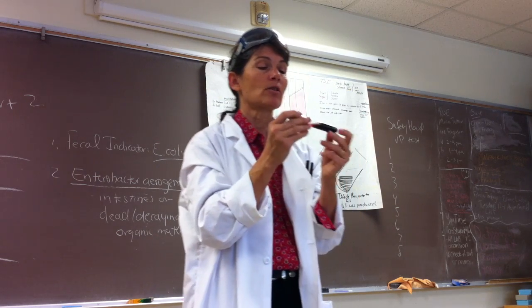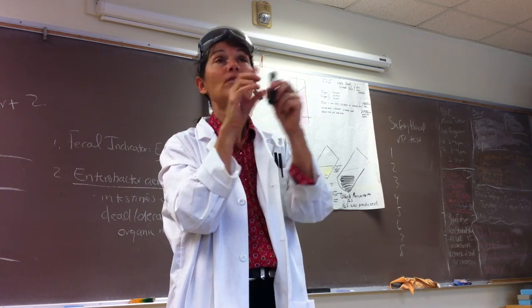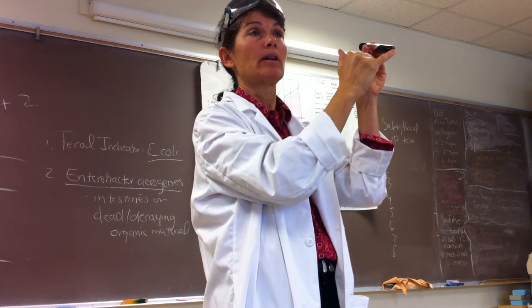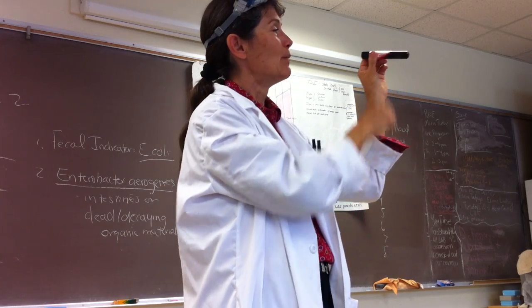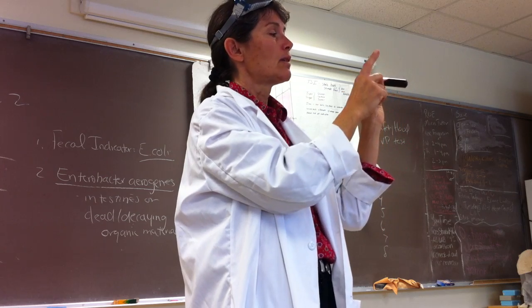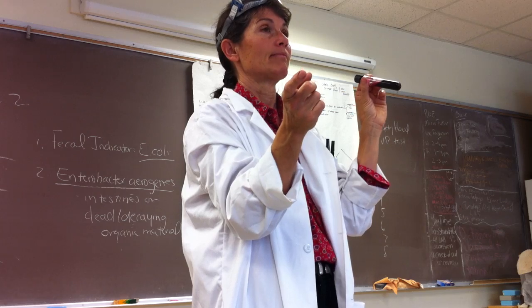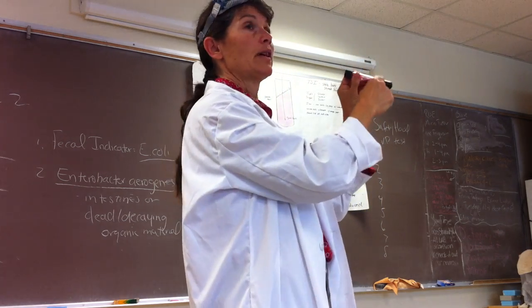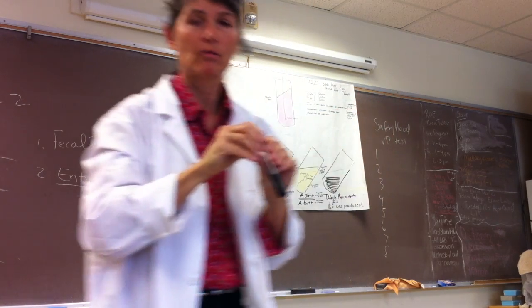Okay. So to answer the question, can your organism make hydrogen sulfide, we're going to look for that black precipitate. And this is incredible, you guys. Be aware, sometimes all they'll make is a little bit of black in the butt. They're so good. I just want to give them a hug. Sometimes it's just a little bit in the butt, and sometimes it's really dramatic. So the iron sulfide tells us they made what? Hydrogen sulfide, right? The iron sulfide tells us they made hydrogen sulfide. That's just a little bit quirky. We just have to remember that, okay?